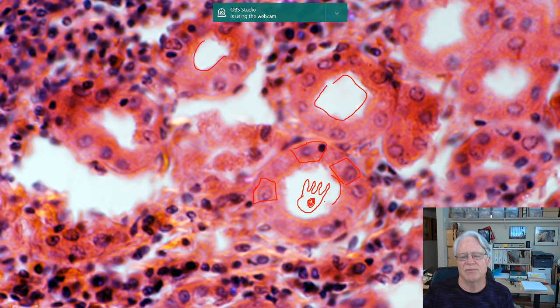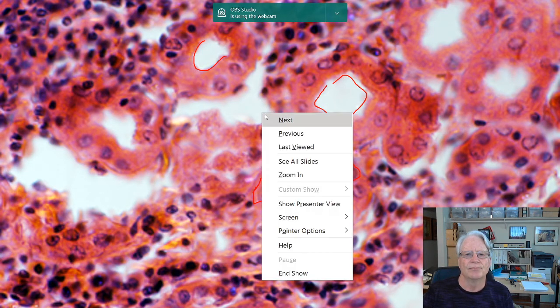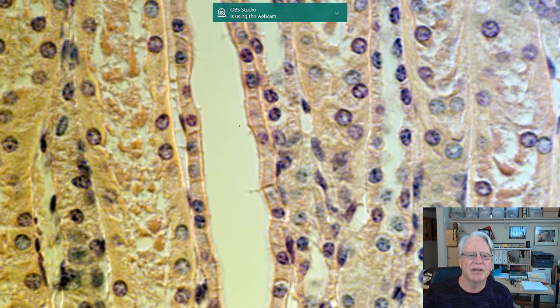And that's why you see that fuzziness. Here again, let's go ahead and identify one of these cells. There's a nice one right there, simple cuboidal epithelium. Here's a nice one right here, simple cuboidal epithelium. Also over here, a little bit more difficult to pick out, but look at the side, look at that nucleus, big and round, takes up almost all of the inside of that shape.